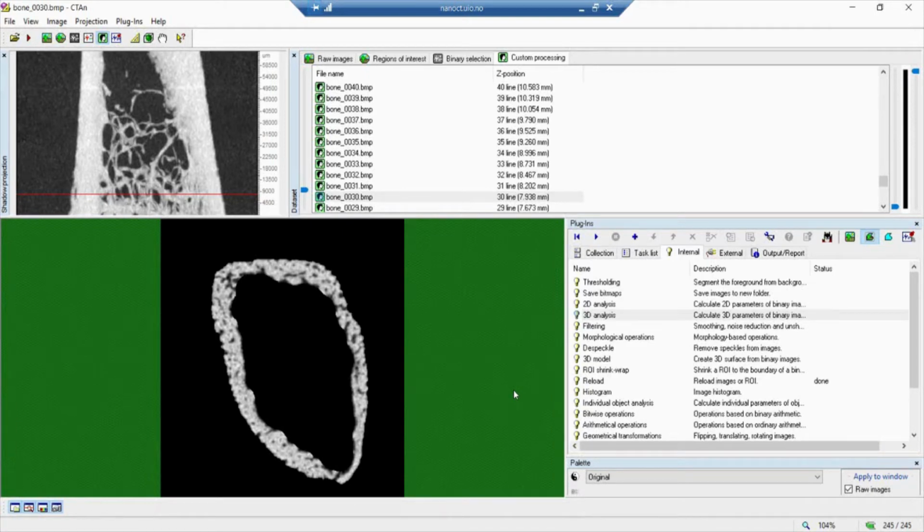Hello, I'm back here to show you a way to create a 3D view of your cortical bone and your trabecular bone in a separate way. You can show them separately, and you can also put them together and separate them in the view. You can create a video and you can crop them separately and together. It's up to you.